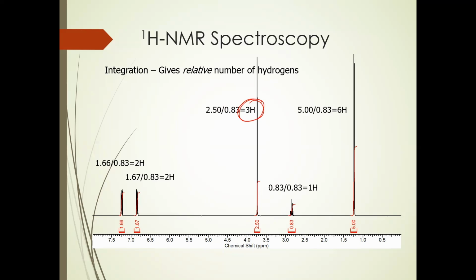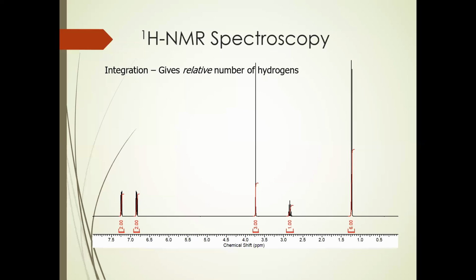And then we know, for example, that we have those integrations that are now corrected, and the computer will do that for you. If you tell it this is a CH3 or this is a CH1, you can have it do all of that math for you. But it's often not done, or it's assumed. The Bruker software, TopSpin, will assume that the first peak you integrate is 1, which isn't always accurate, and you may need to go back and adjust it. But the number should be close to whole numbers.